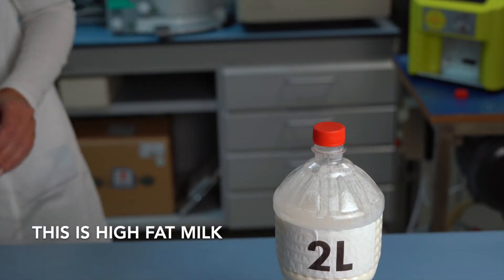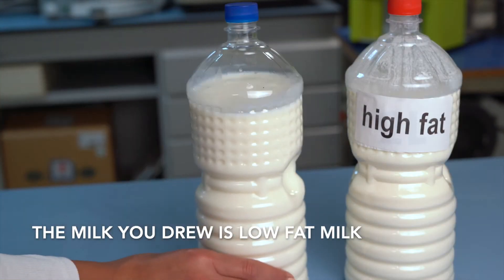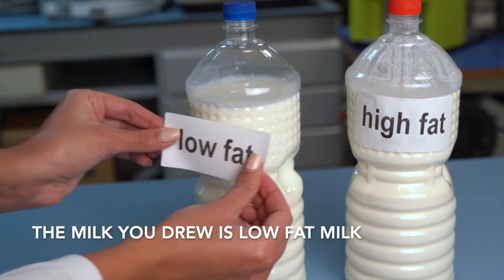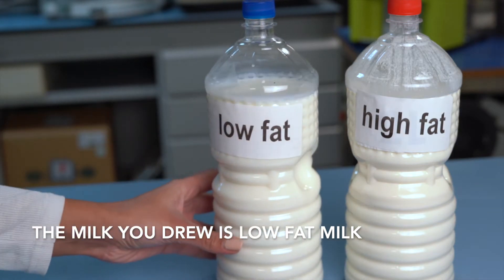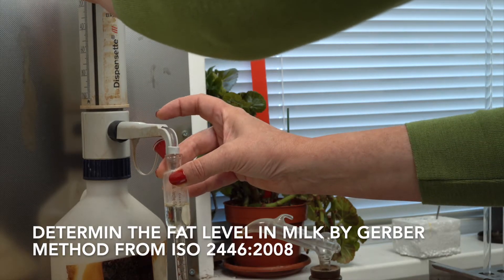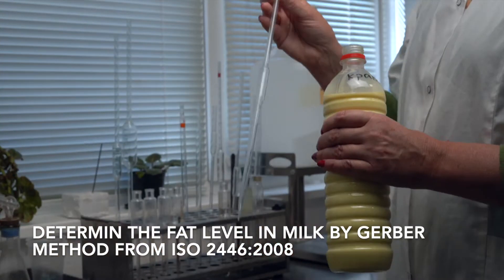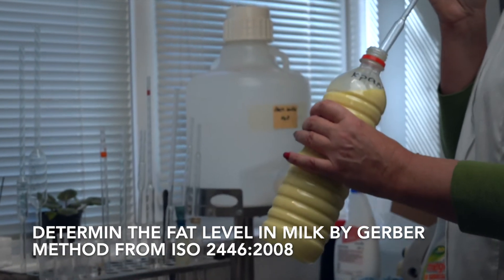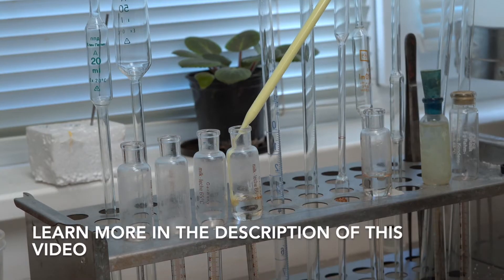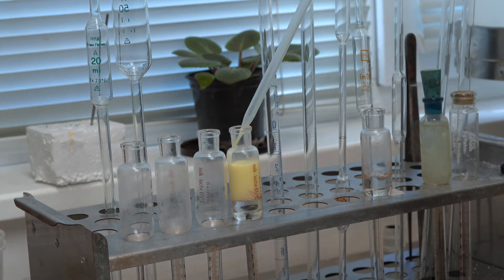This is the high-fat milk. The milk you drew is the low-fat milk.